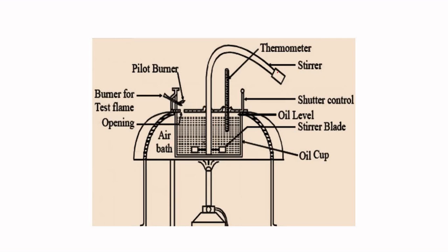Here you will see the stirrer, then the thermometer. The oil cup is given here; the oil level is up to this mark. The stirrer has blades to maintain uniform temperature. There are 2 burners used here — this is the pilot burner, which introduces the flame to the vapours coming out of this point. Then another one, that is the burner for the test flame. Here you can see the shutter control.